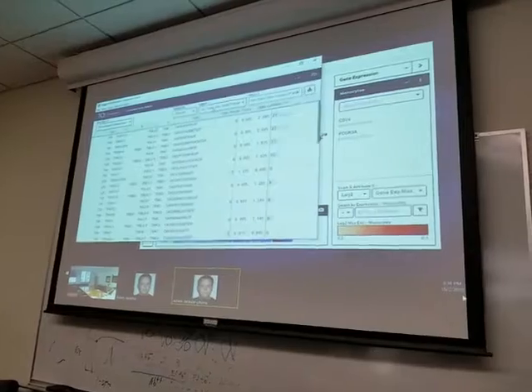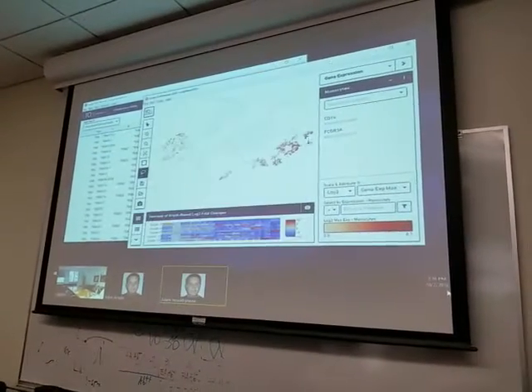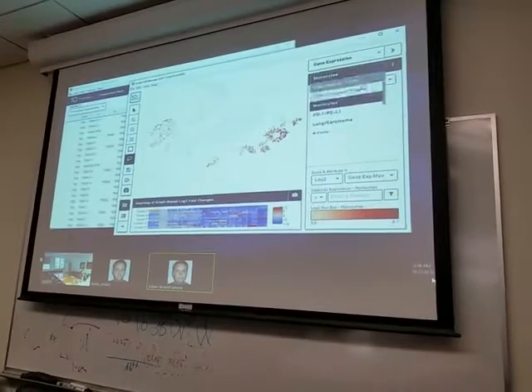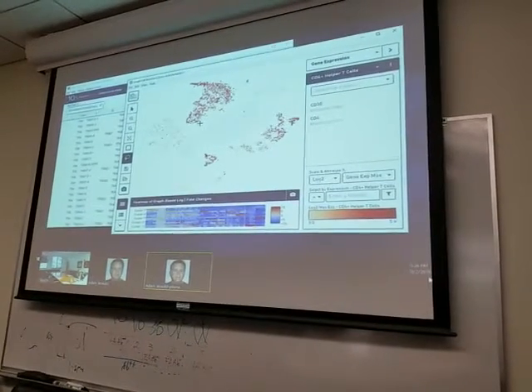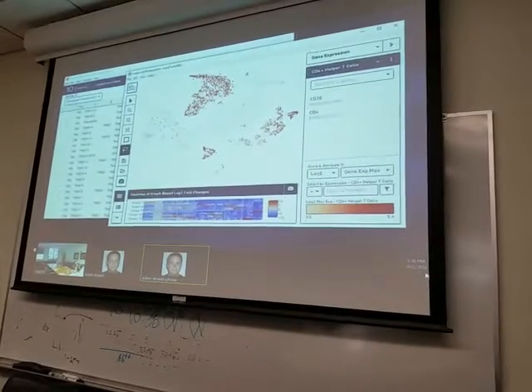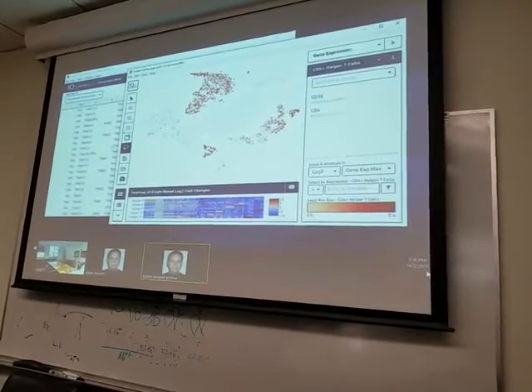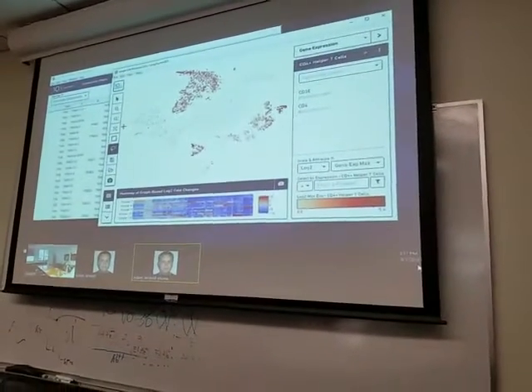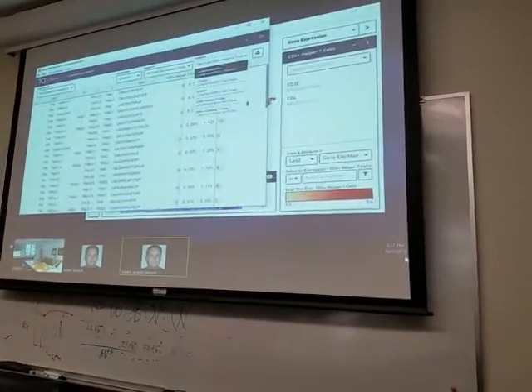So this cluster identification was based on me playing around in here. So you can pull some information back and forth between the two. It's certainly not perfect, right? This is clunky to have to do it this way, but this is how you can leverage some of that information.